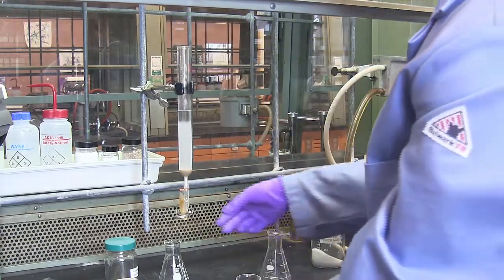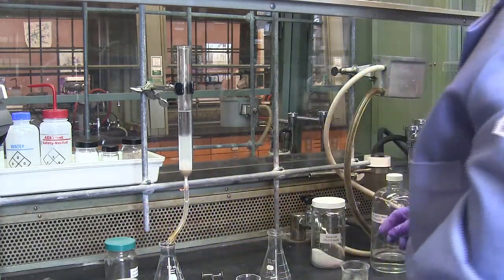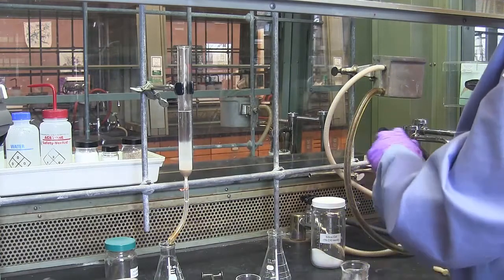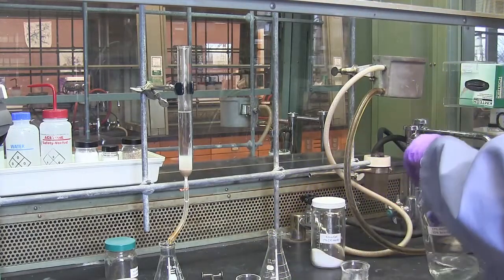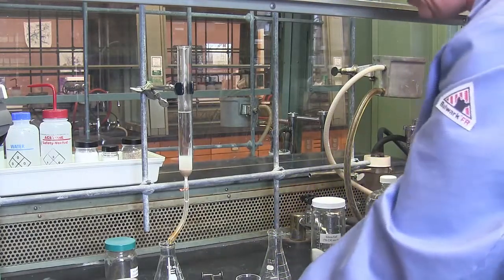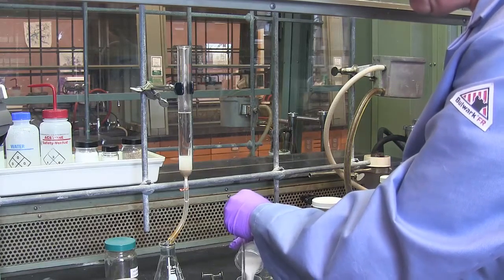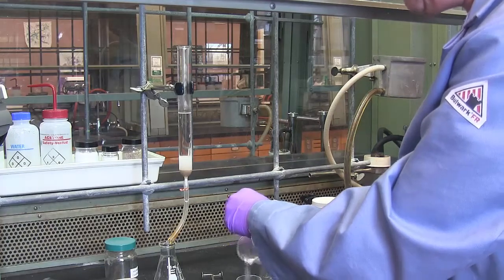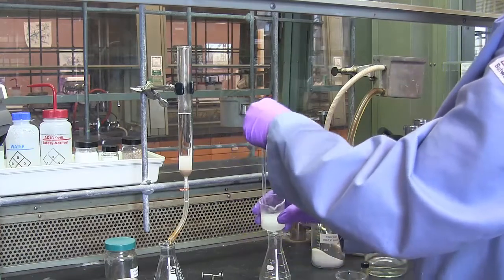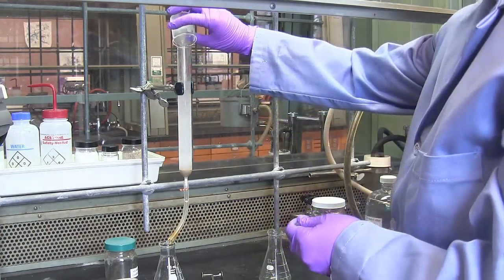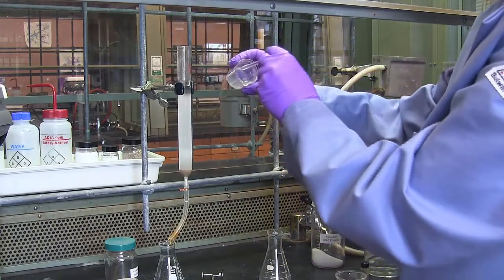At this point, I can open up the column and allow eluent to collect below. I have more silica to add, so I add more solvent. Wet the silica with the solvent by pouring the silica into the solvent, and pour that quickly into my column. You do need to pour it quickly or the silica gel will stay behind in your flask.